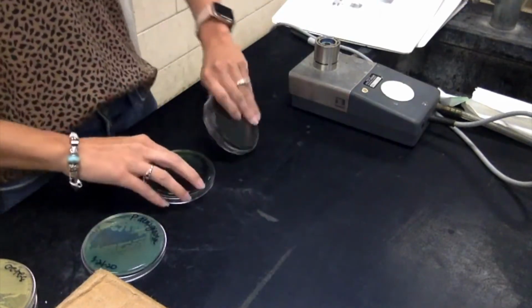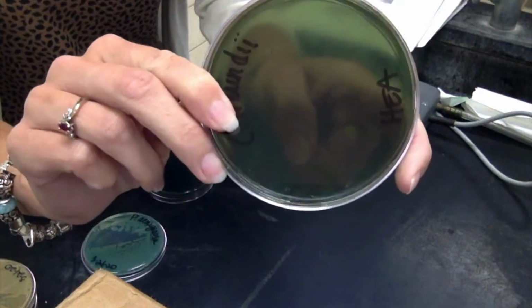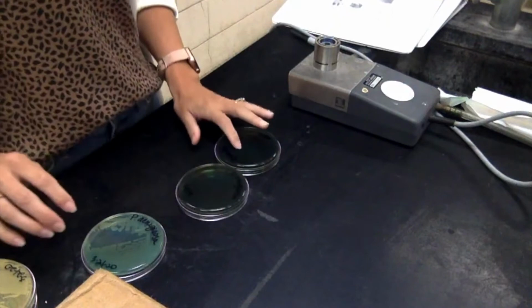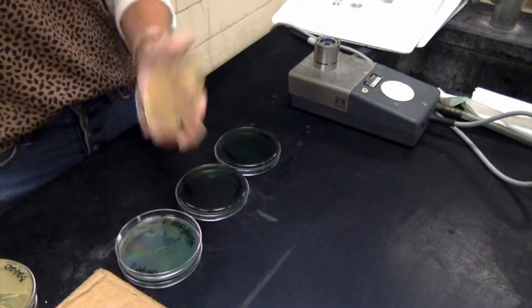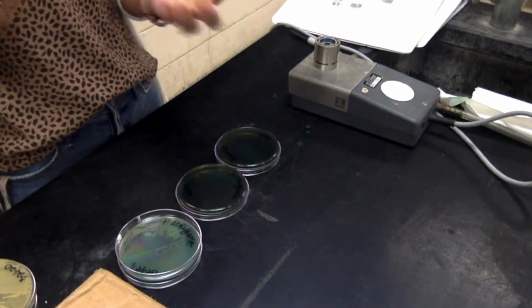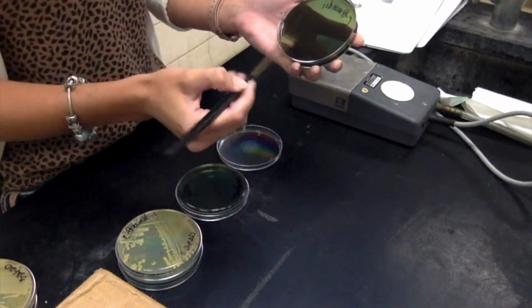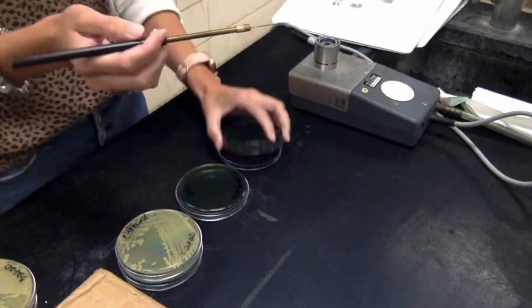All right, here's last. This is the HEA. So if you see, it is a green color already. That's that bromothymol blue that's in there, giving me that green color. So I'm going to do Citrobacter freundii and Pseudomonas for these two. So I'm going to do the Citrobacter freundii first. This is the one that is a gram-negative lactose fermenter. So it should give me the negative result for HEA, which is the coral color.